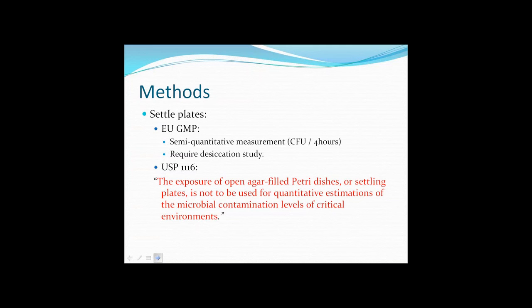There's also perhaps a difference from, say, some of the work carried out by Bill White, which is quite robust in the defence of settle plates and indicates that where the settle plate's in the right location, then as an indicator of gravitational settling, it can be quite revealing about the potential risk to products and contamination.